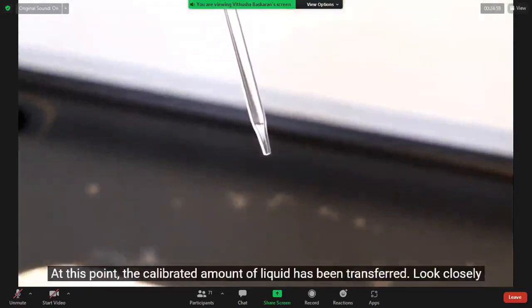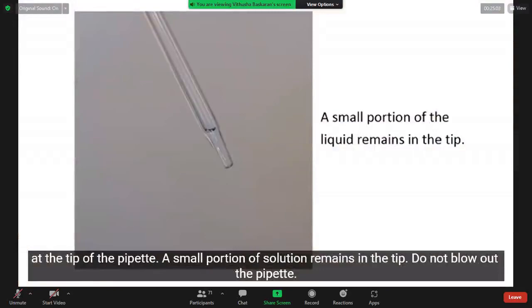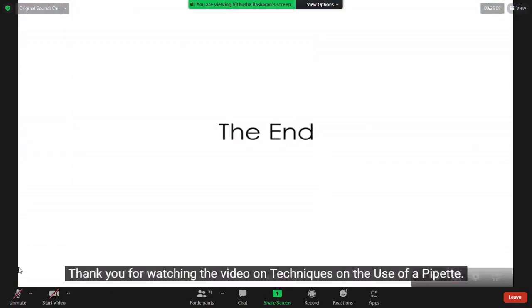At this point, the calibrated amount of liquid has been transferred. Look closely at the tip of the pipette. A small portion of solution remains in the tip. Do not blow out the pipette.